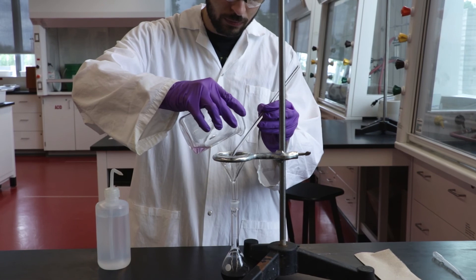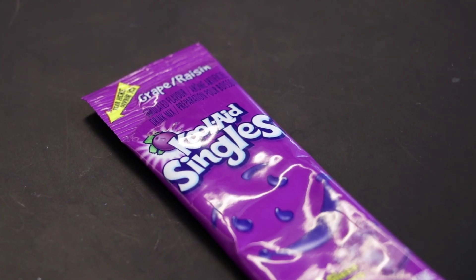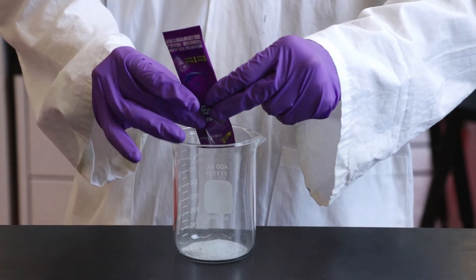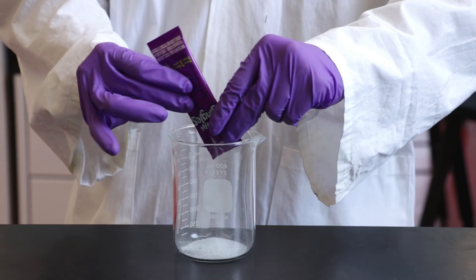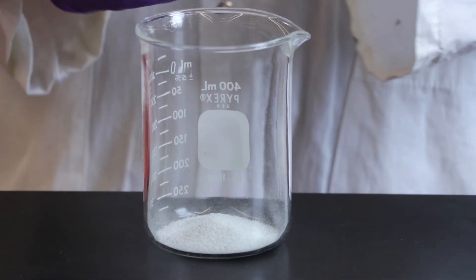You will use quantitative transfers often when working in the chemistry laboratory. To begin we add the solid into a 400 milliliter beaker. Note that the volume markers on the beaker are for estimation only and give an approximate volume within 5 milliliters of the actual volume.